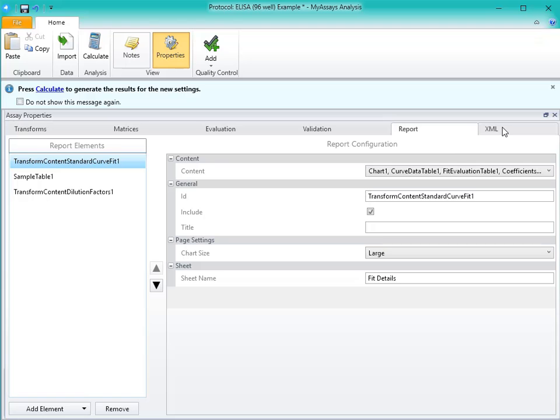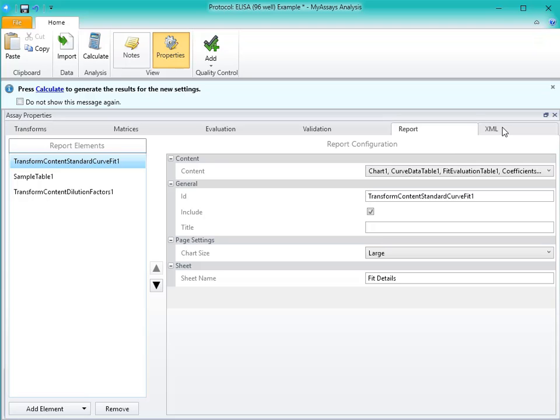The XML tab is used for specifying advanced settings. We've created in-depth training modules on these topics, so for more information on transforms, matrices, evaluations, validations, and report configuration, please see the associated videos.